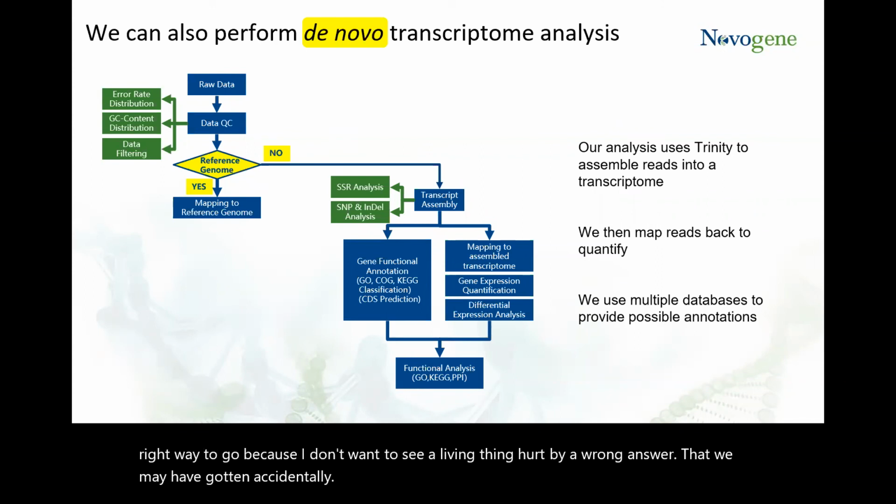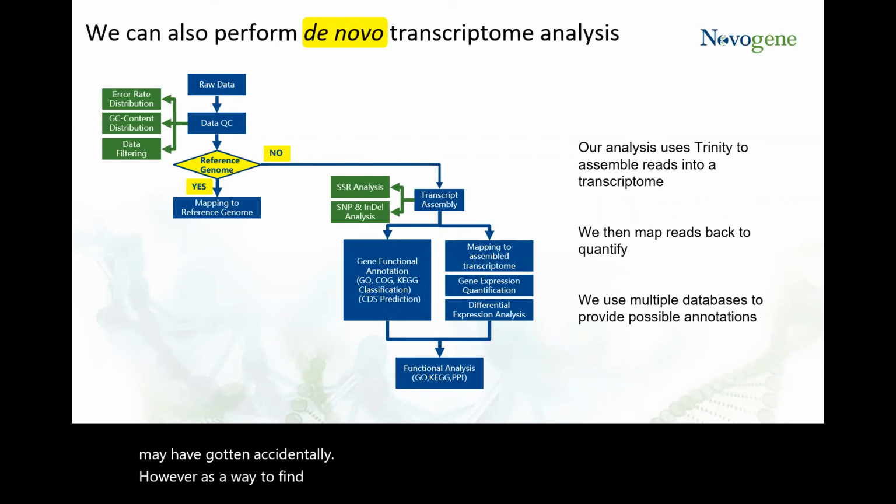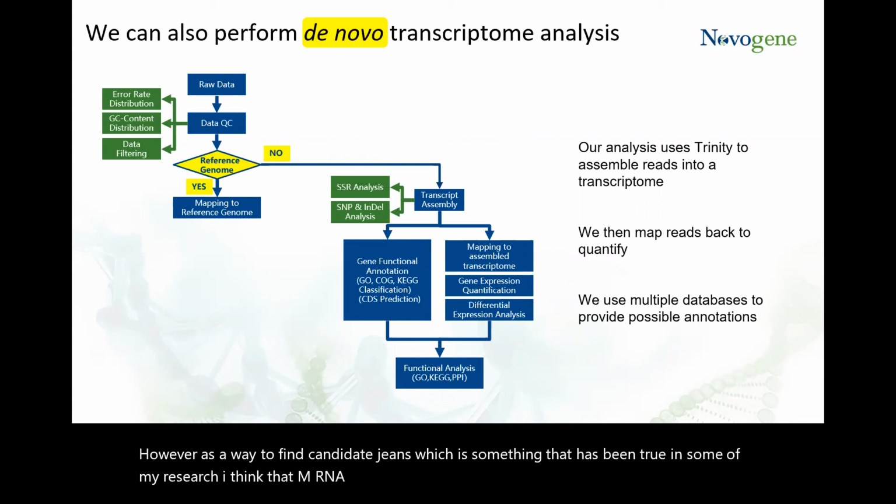However, as a way to find candidate genes, which is something that has been true in some of my research, I think that mRNA-Seq is a fantastic method. And I think that many experiments, if you achieve the right coverage, don't rely as heavily on needing that validation.